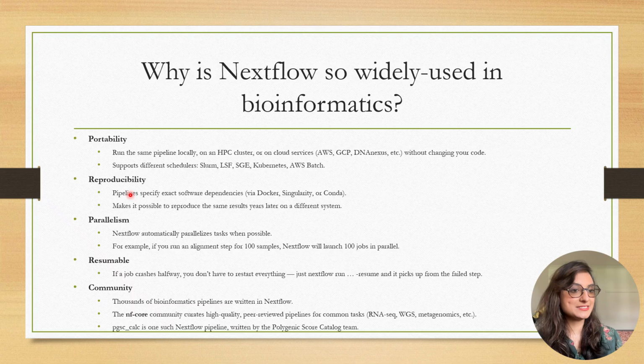For reproducibility, pipelines specify the exact software dependencies via Docker, Singularity, or Conda. And it's possible to reproduce the same results years later on a different system.